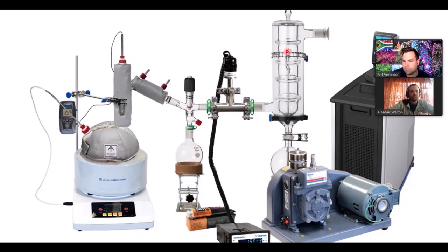And then maybe also explain the need for the cold trap that's at the back here. What's the purpose there? So the biggest thing is protection for your vacuum pump. Yep. Vacuum pumps can be sensitive pieces of equipment. What we're working with here tend to be very highly volatile compounds, especially things like terpenes, that may only condense at exceptionally low temperatures. So what we do with that cold trap is we fill it either with an immersion chiller or with dry ice and a solvent to try and get the coldest temperature we can. That effectively protects the pump from pulling any vapors that still have enough energy to move through the system. Those vapors then condense in that cold trap and collect at the bottom there.